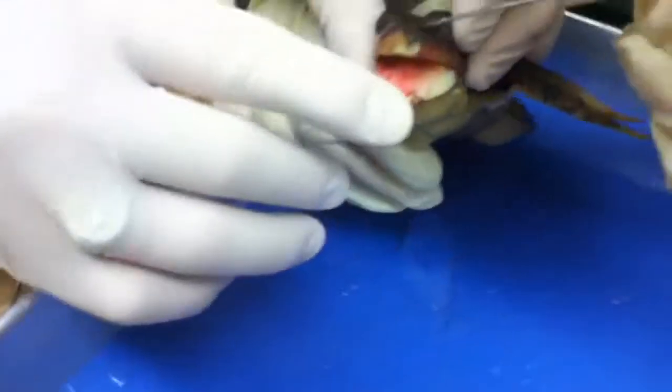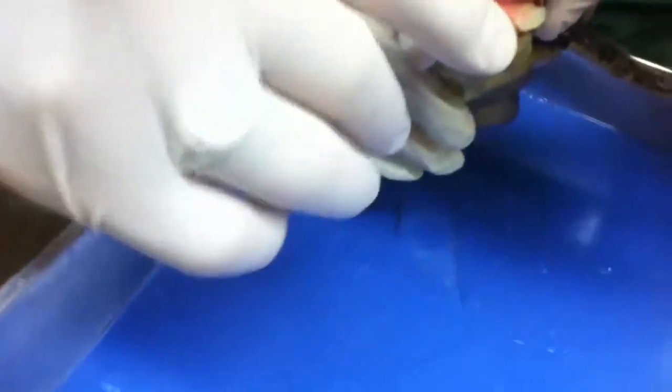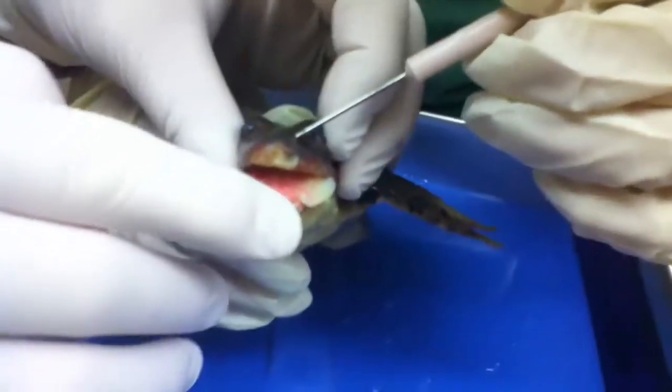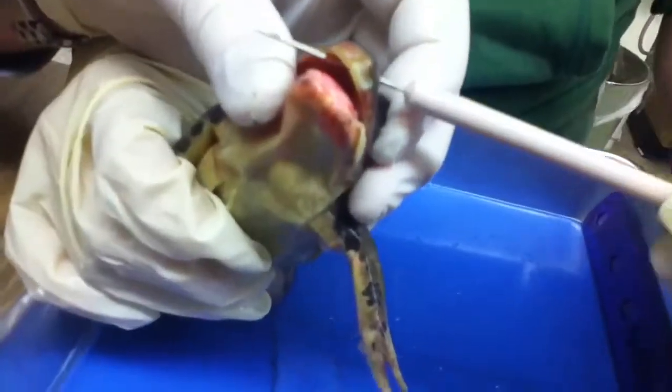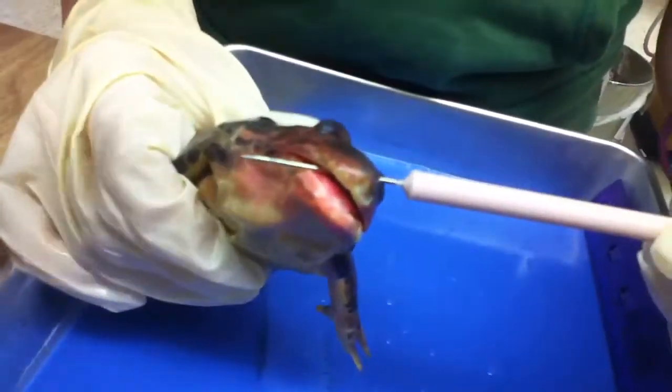Okay. So I just shove it in his nose? You're not shoving anything. You're following the natural path. See, you didn't shove anything in. You just followed the natural opening. So now you've got this. Now look.